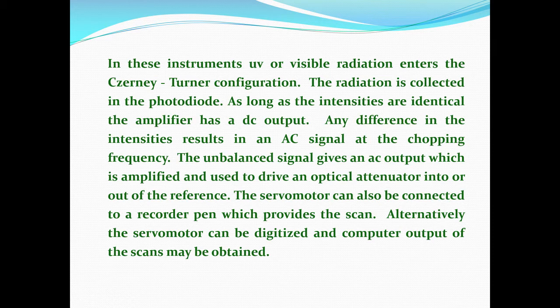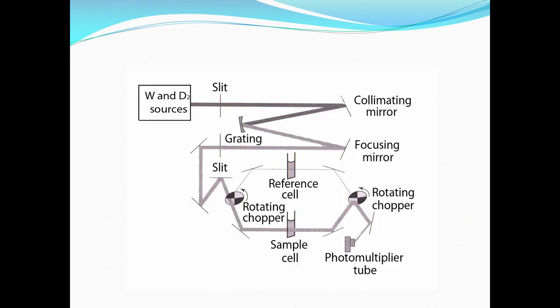automatically included in spectrophotometers, because the scanning should be a continuous operation as far as possible. So, the servo motor also can be digitized, and computer output etc., are quite possible in a spectrophotometer. That gives you unlimited flexibility in the operation.